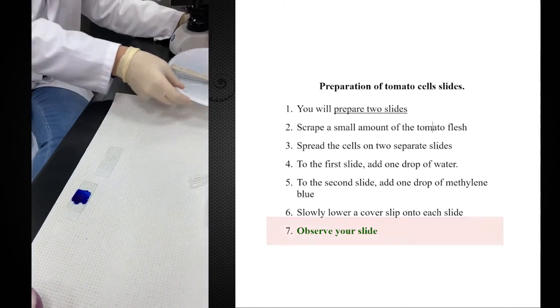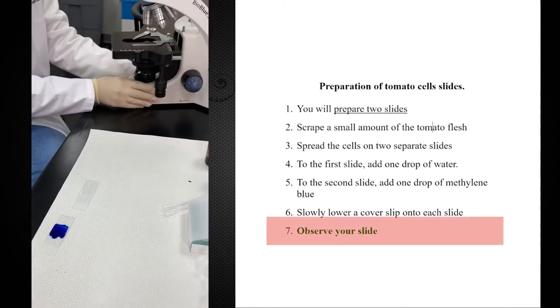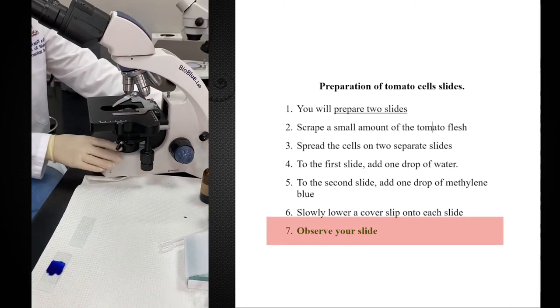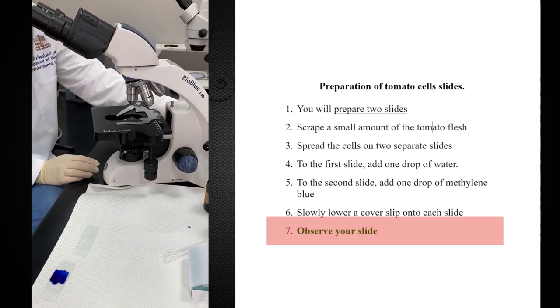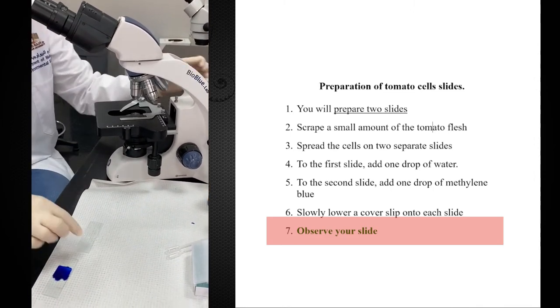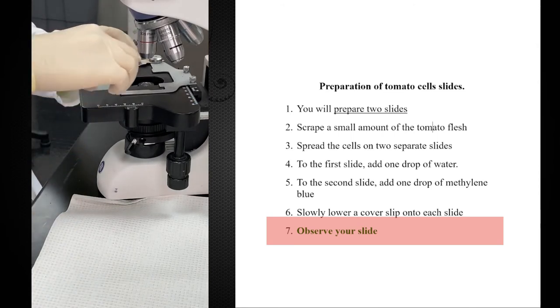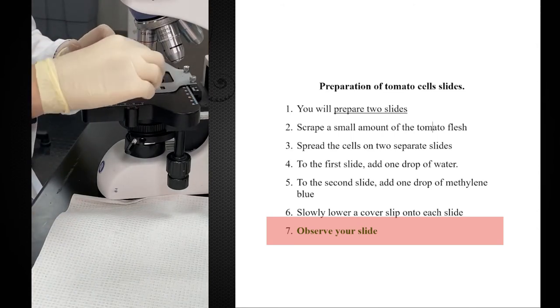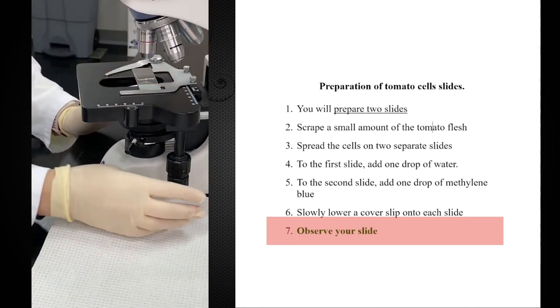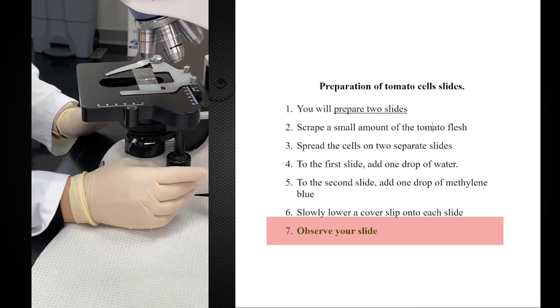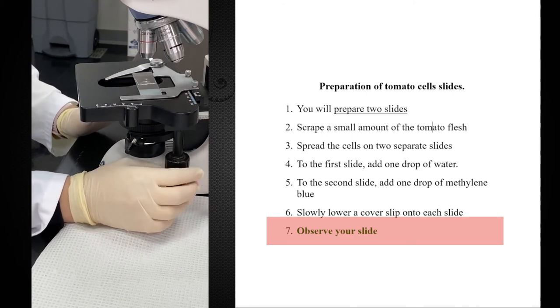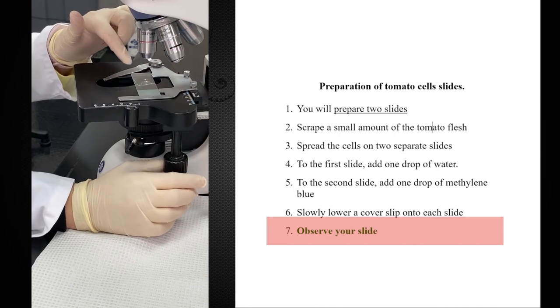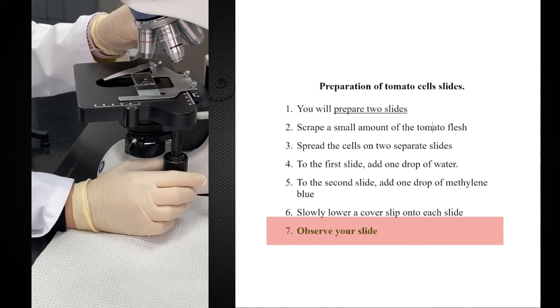Then you have to focus this under the microscope. So you turn on your microscope and you put the slide on the stage, fix it with the stage clips. I can see the specimen here, so I move the slide backward, forward, right, left until the specimen is positioned in the middle of the spot of light.